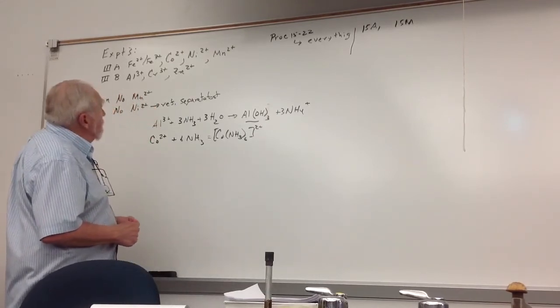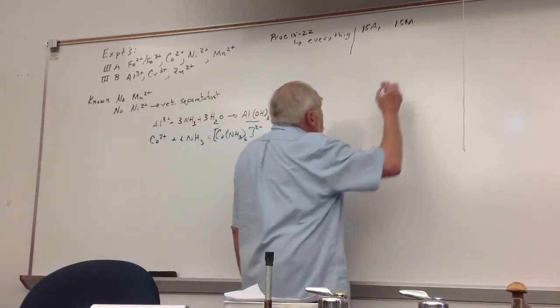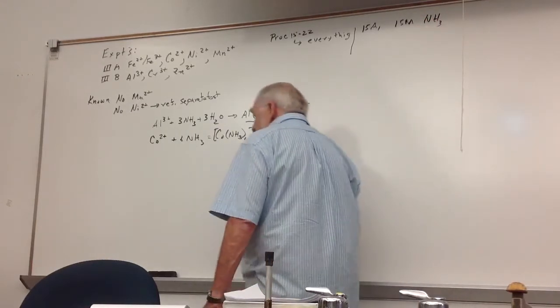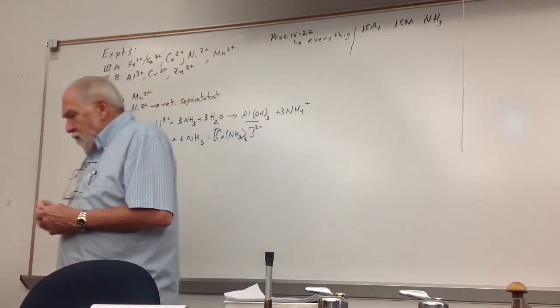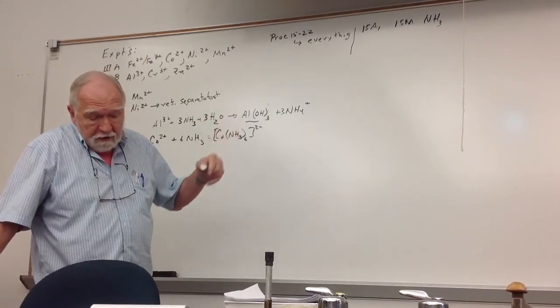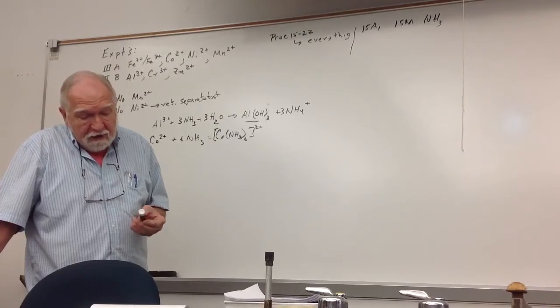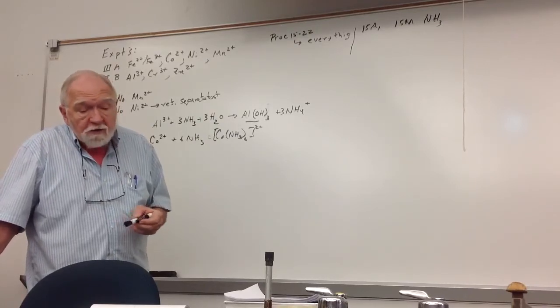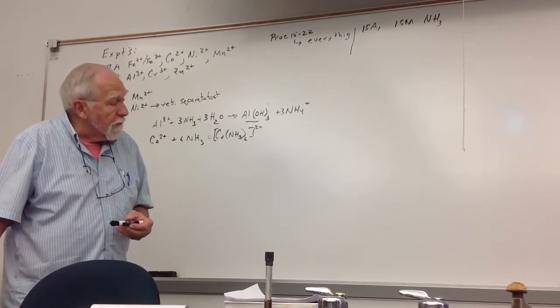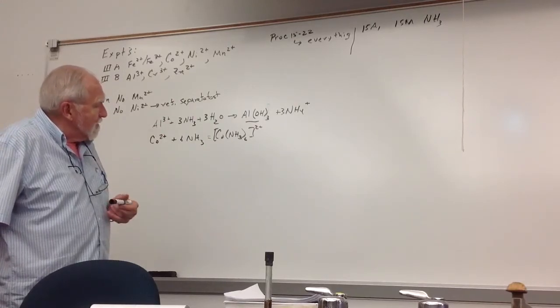Okay. Going back to this at 15A, you're doing 15 molar ammonia. I've got to finish that out. And you're looking at the colors, and somebody asked, when should I record things? As you're adding it, you can record what the initial precipitate looks like. If it looks the same all the way through, then you don't have to say much more than that. You can say what the solution looks like. All of these are clues that you look back at when you're trying to decide which things are in your unknown. Look back at your reference ones. Notice the unknown won't necessarily have all of these.